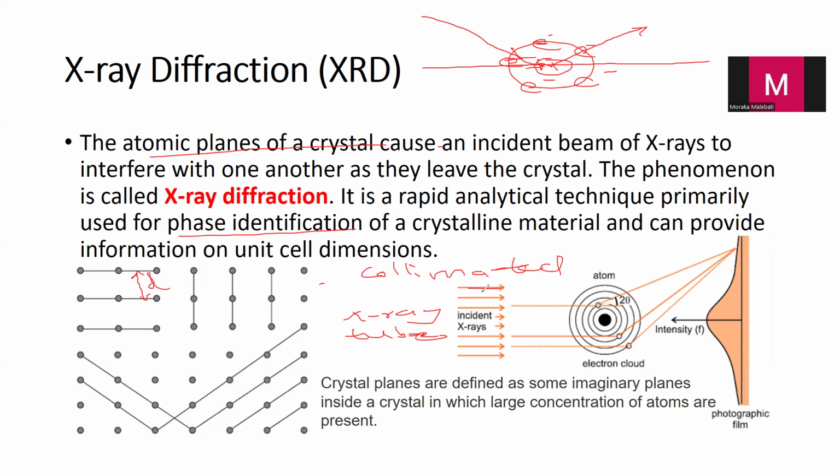Can you now see? It's collimated because these beams travel in parallel lines, with the rays not spreading out as they move. They are parallel to one another. This means the beam stays narrow and focused over a long distance.